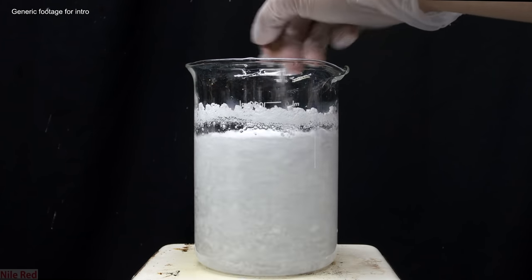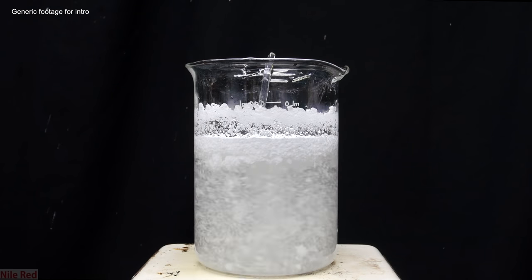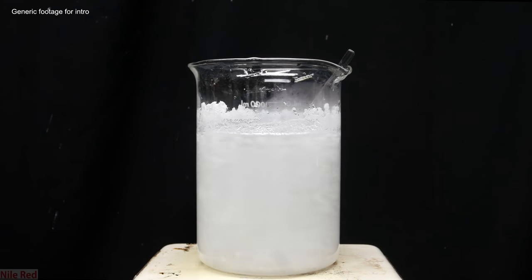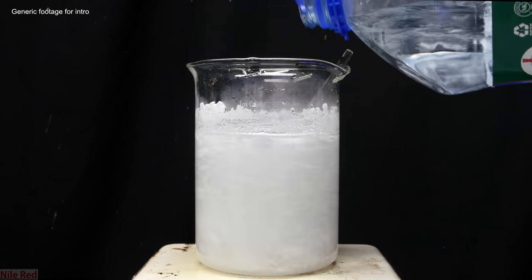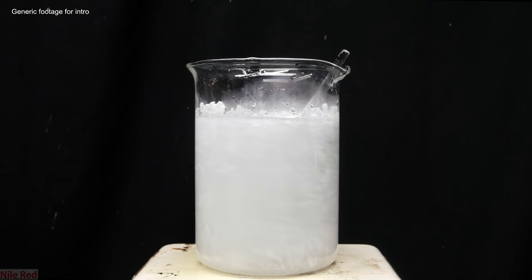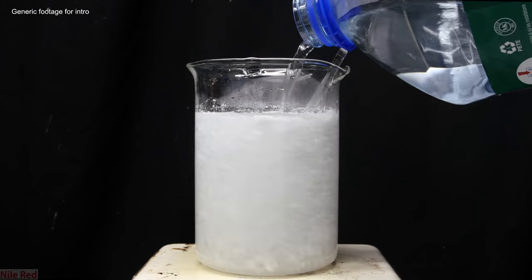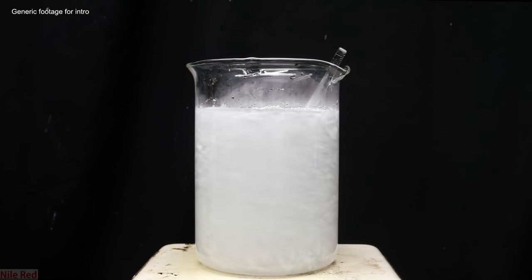That's really general, and we're going to have to elaborate a little bit more on that. The basic premise is that we take a compound that's impure, we dissolve it in a solvent when it's hot, which will dissolve both the compound and the impurity, but as the solvent cools down, our actual compound will precipitate out and form crystals, whereas our impurity will stay dissolved in the solvent. Our product precipitates out because its solubility decreases as the solvent cools down.